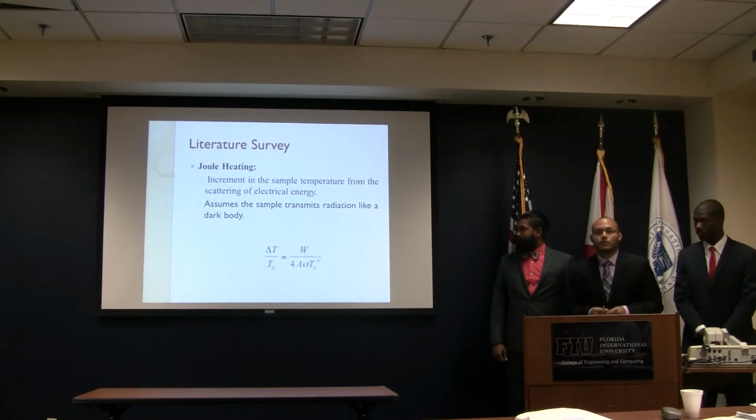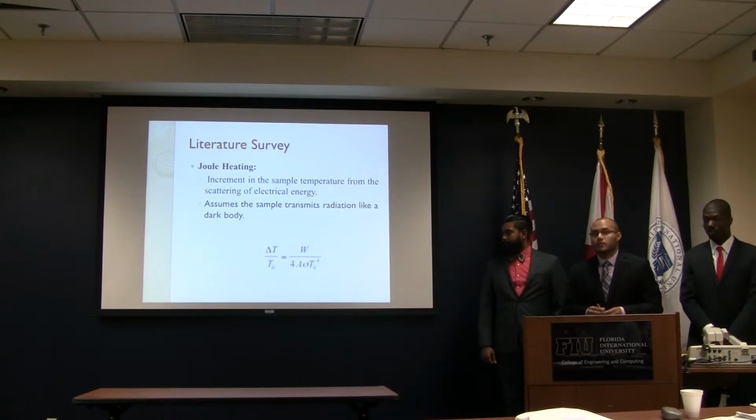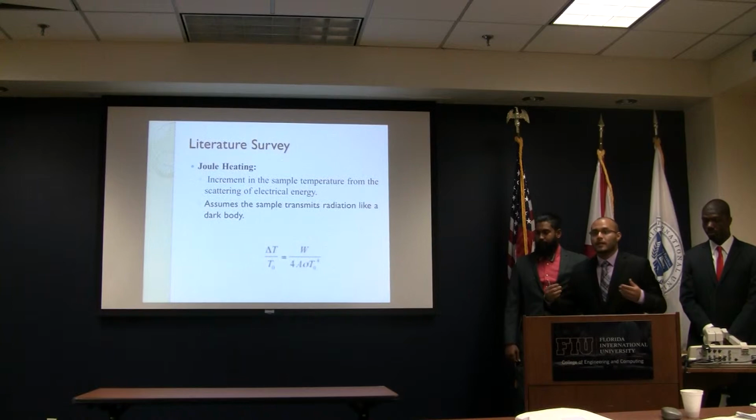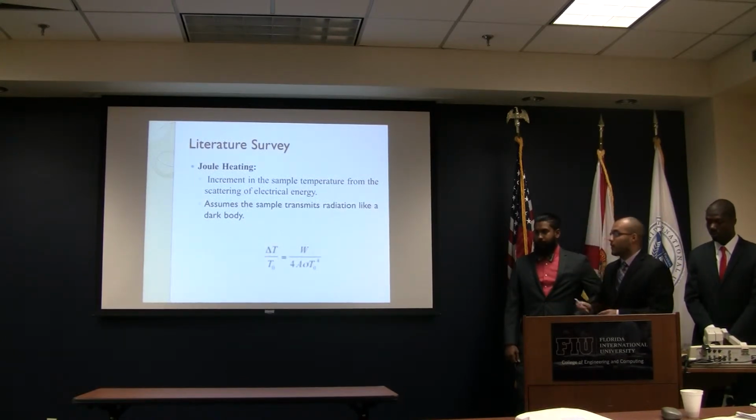One of the explanations for field-assisted sintering and flash sintering is the Joule heating effect. This is caused by the electric current passing directly through the sample, and like I said, causes the sample to heat up from the inside out.